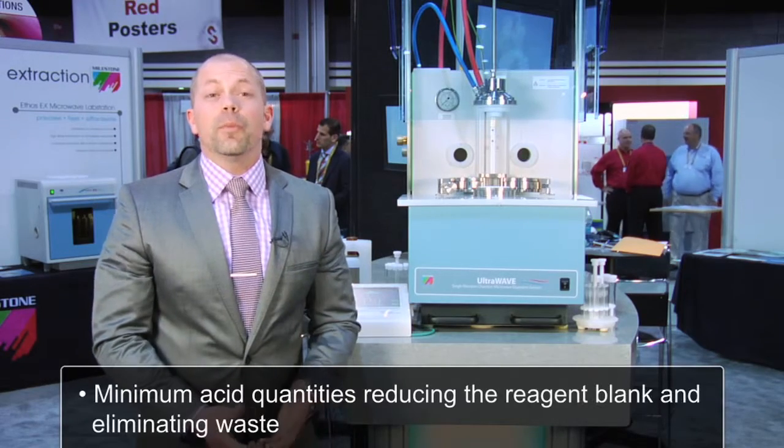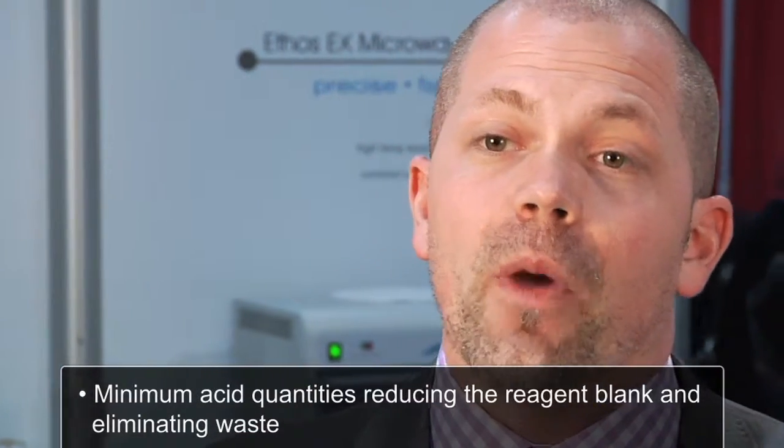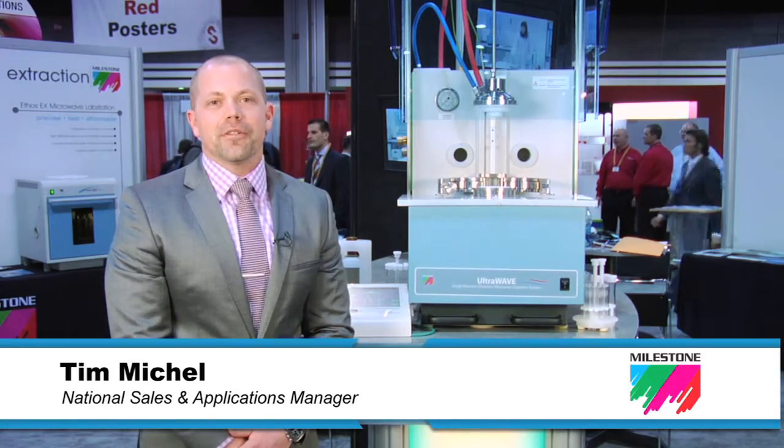In the Ultrawave, we can use minimum acid quantities, which greatly reduces the reagent blank, as well as eliminates waste. I'm Tim Michael from Milestone. Thanks very much for your attention.